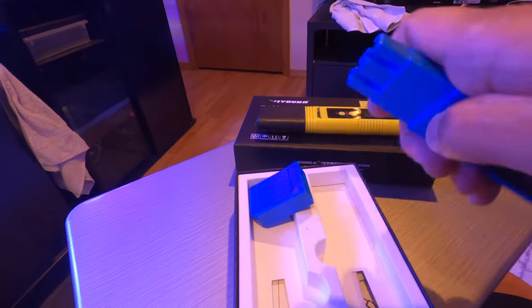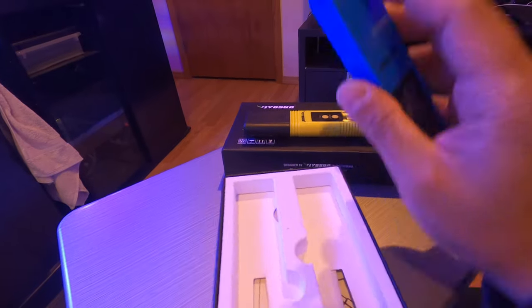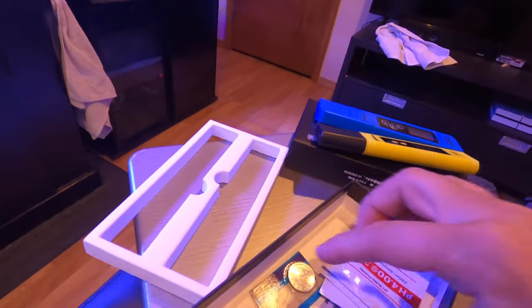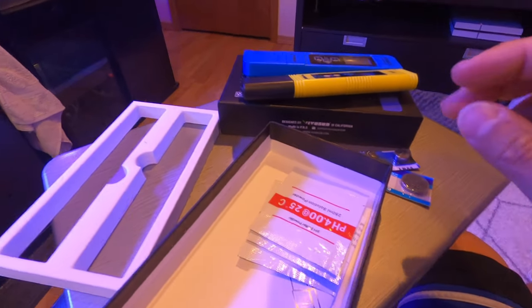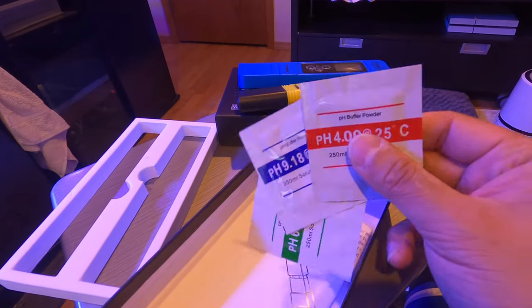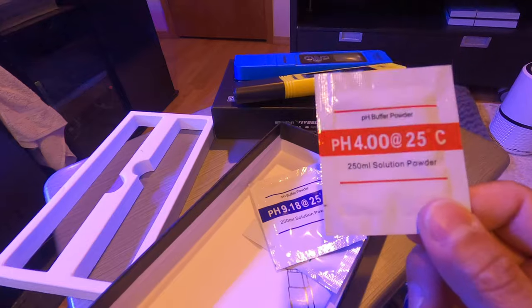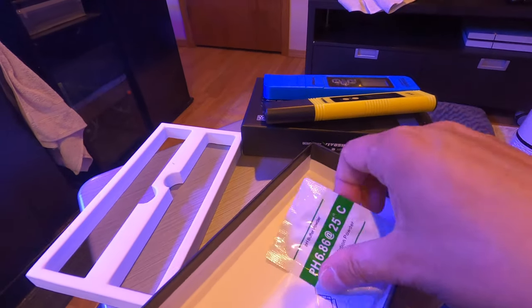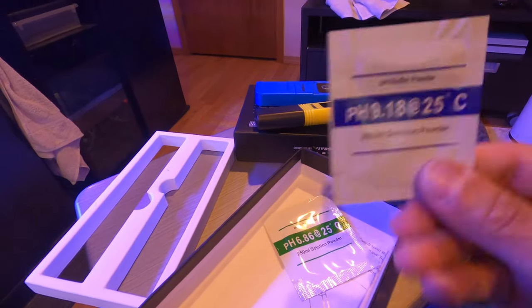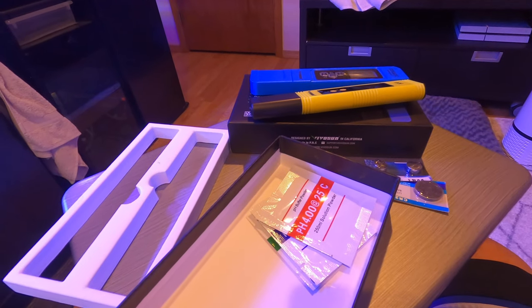This is the TDS — total dissolved solids — monitor. Open it up on this end; this is the end you stick in the water. You also want to make sure you clean it well before storing it. Batteries are included. There are two meters with different batteries, and three calibration packets: pH 4, pH 9, and pH 6.8 — essentially neutral, high end, and acidic end. There's also a one-page user manual — I love it, no complications.